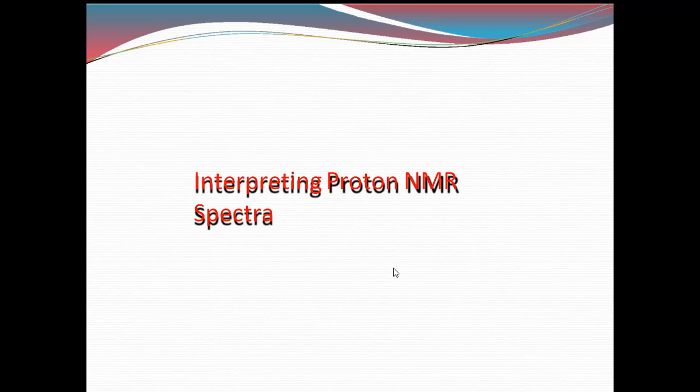I'm just continuing the last class. Last class we discussed NMR, isn't it? NMR is nothing but this: every nucleus has its own spin, and it also has spin states. The number of spin states generally depends on the quantum number that we have discussed.